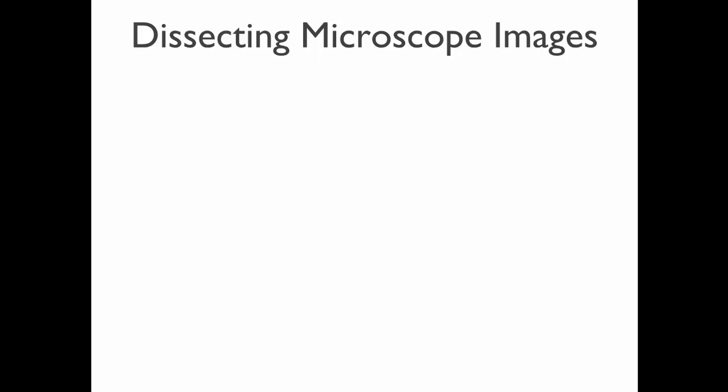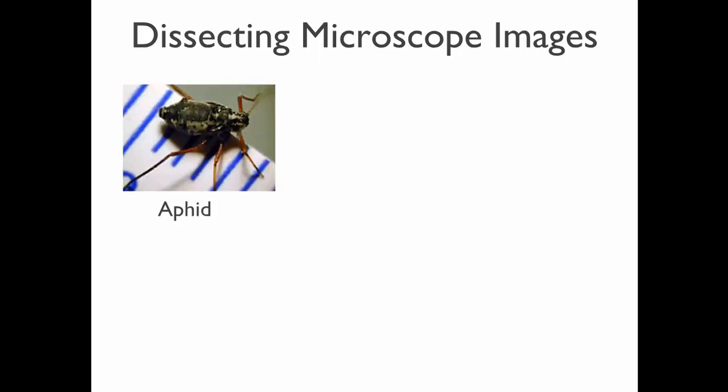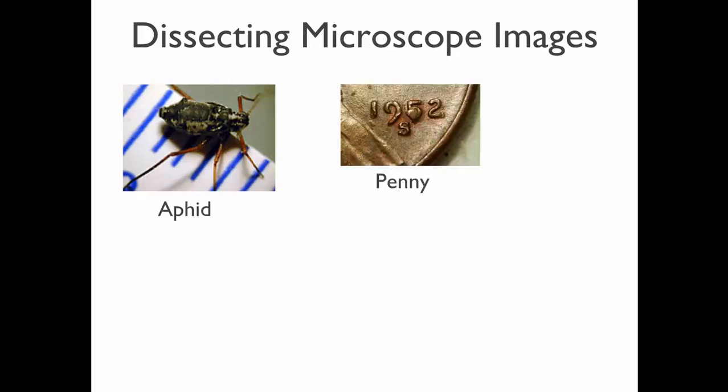All right. Why am I going into all this? Because this microscope gives you binocular vision. You look through two eyepieces. Each eye is getting a separate view of the image, allowing your brain to get a sense of depth perception. When you use this microscope, you'll see the object looks three-dimensional. You can see the depth to it, unlike a flat image that you get from a compound microscope.